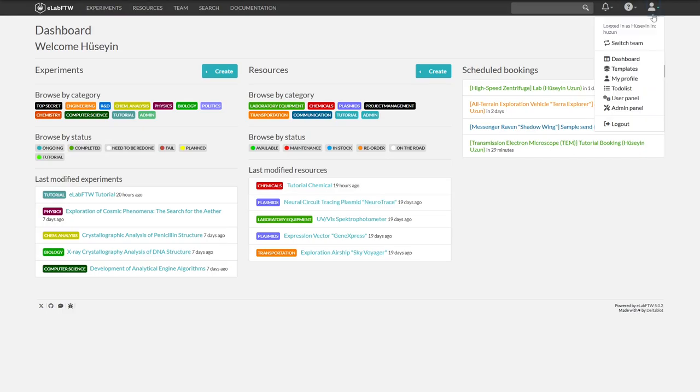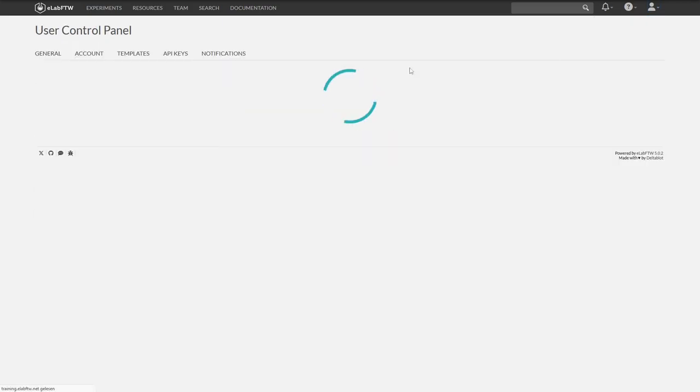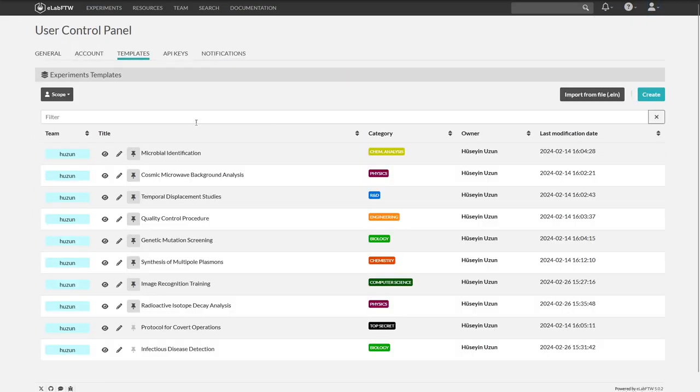We click on the small figure at the top right and then on templates. Here we are in the user panel and can already see the templates.